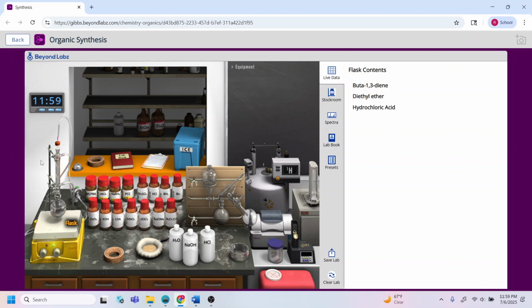When we start the reaction, I'm forming the 1,2 product. This is the kinetic product. Not using heat, I think it's going to take a couple of hours. So let's try 1 hour and see. If we try 1 hour, I'm forming the 1,2 product, but I still have some of the remaining reactants. So I want to get rid of those. I need to keep going on, I cannot stop. This is the second hour. So now with the second hour, see what I have?